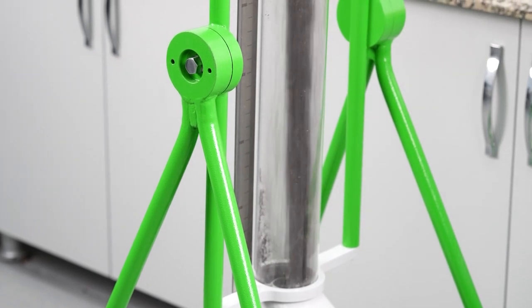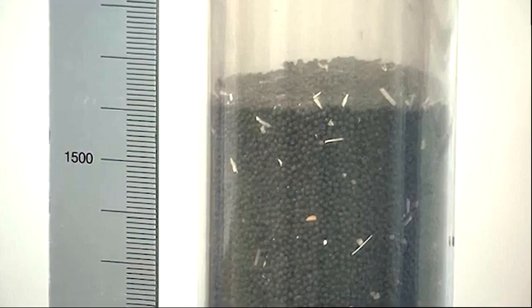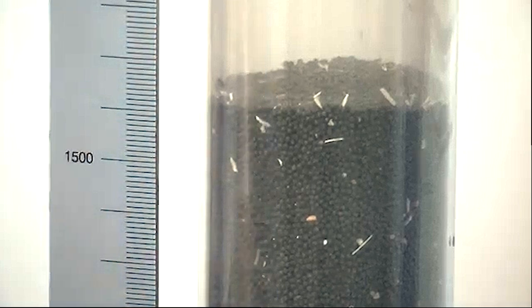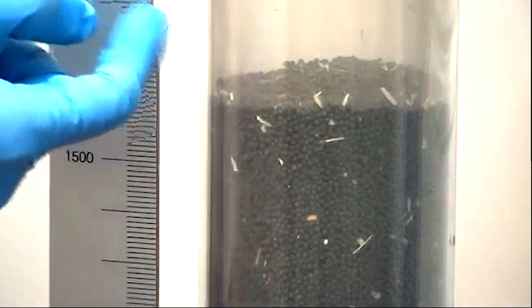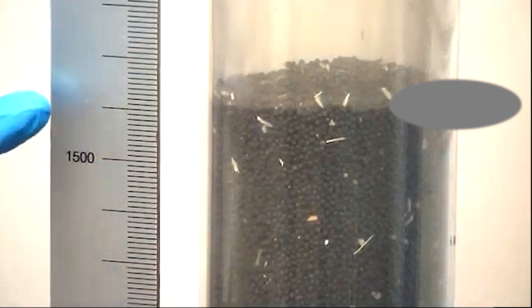After the transfer is completed, the volume of the seeds in the transfer tube is read in cubic centimeters from the measurement ruler. Thus, the volume value of the bakery product is determined using the Batac brand 13300 model bread volume measuring device.